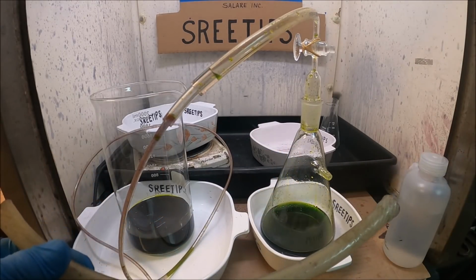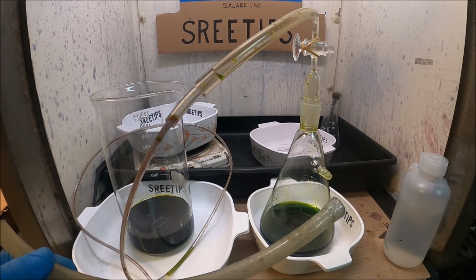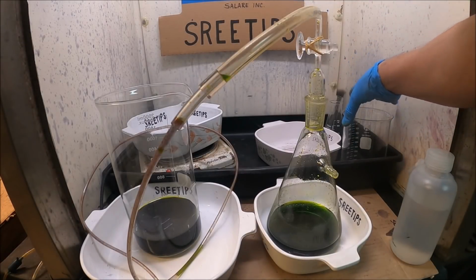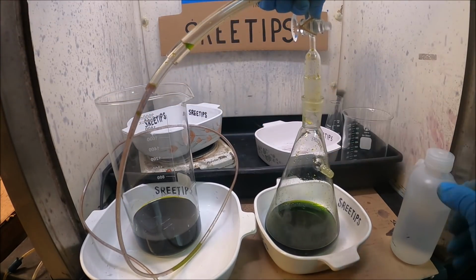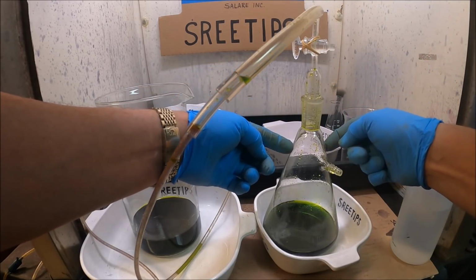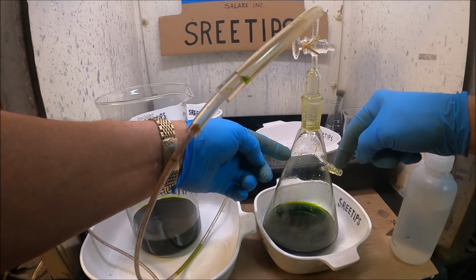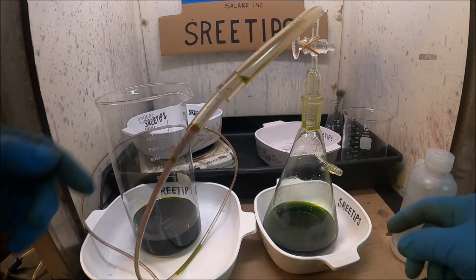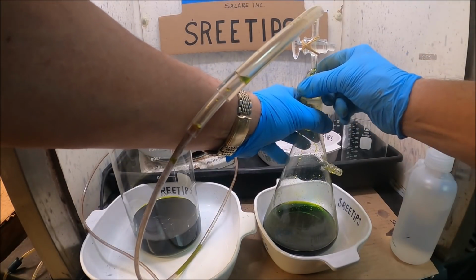Lessons learned here. We don't want to use this kind of flask to draw our gold solution off with. That's what I get for not testing a new device here. Made a mess, so now we got to clean all this up. What happened was I started drawing the solution into the flask. Some of the solution was flowing over towards the outlet pipe here where the vacuum connection is. It got sucked up into the vacuum line. Luckily, none of it made it uphill to the vacuum pump area.